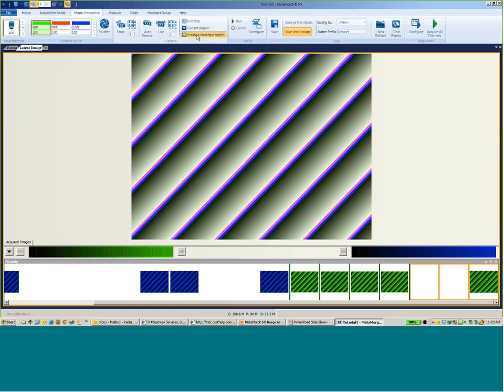Your autofocus control, so this is the software autofocus configurations. If you're going to do a hardware control, there'll be a different option for the ZDC. So the autofocus option here is for the software-based autofocusing. Actions allows you to set up specific actions to happen during the acquisition, go to a different field of view, or things of that nature. To be honest, I've never really played around with actions too much, so I can't comment. If you go to the help file, it may have a little more definition about what the actions do.